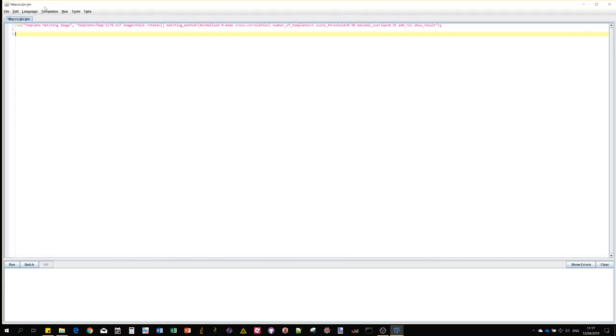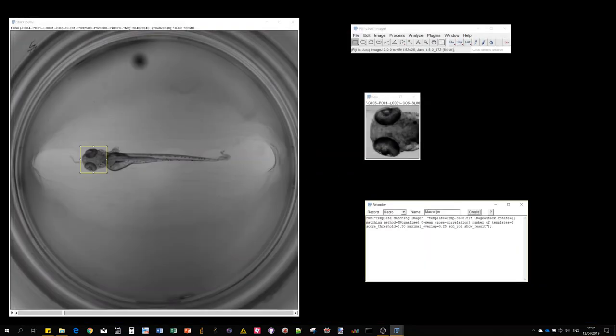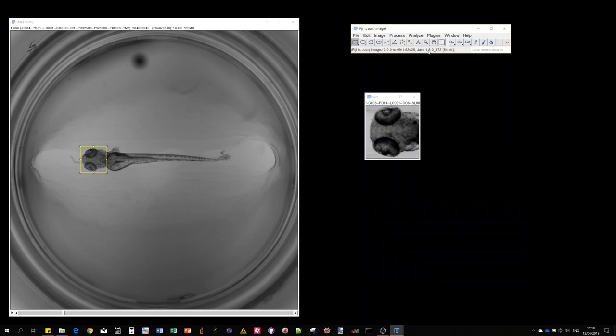Coming back to the macro recorder, we got our command. If I click create, it opens the macro editor. The command has similar parameters to the GUI. What you would need to change for a new image would be the template field and the image field with the name of the image you'd like to use. I'll have a dedicated video on macro recording, but keep in mind it's possible to use it in custom image processing.